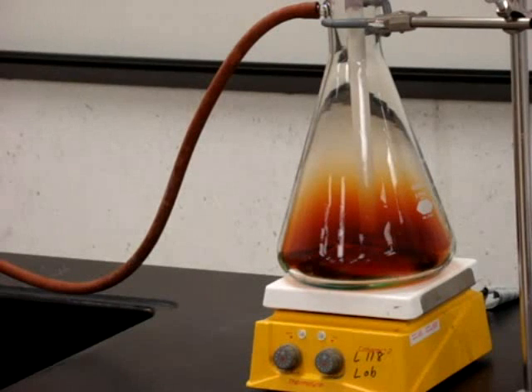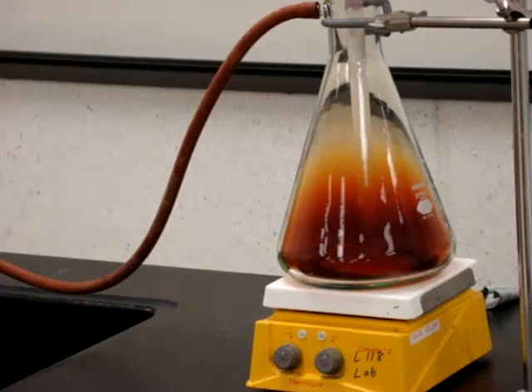How should I stop this? I tried to get rid of the objectionable mess by picking it up and throwing it out the window. I learned another fact. Nitric acid not only acts upon copper, but it acts upon fingers. The pain led to another unpremeditated experiment. I drew my fingers across my trousers, and another fact was discovered. Nitric acid acts upon trousers.